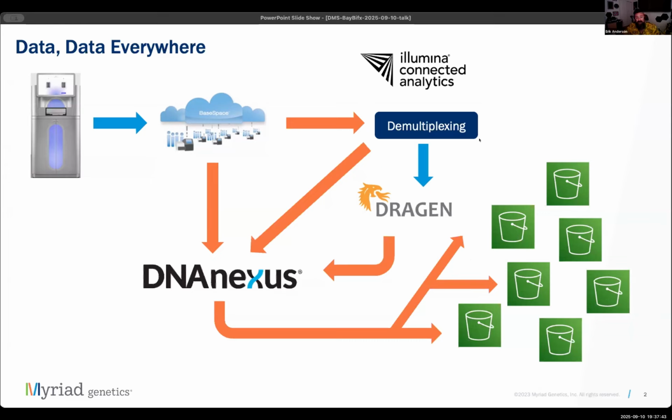Before we can use any file that was transferred from one system to another, we need to validate the transfer by comparing the original file's checksum against a new checksum calculated using the destination file. Every orange arrow here indicates a required validation. These validations need to be recorded in an auditable manner. Once we've transferred a file from one platform to another and validated the transfer, we end up with two copies of the same data. Once analysis is complete for a sample, many files are no longer needed.